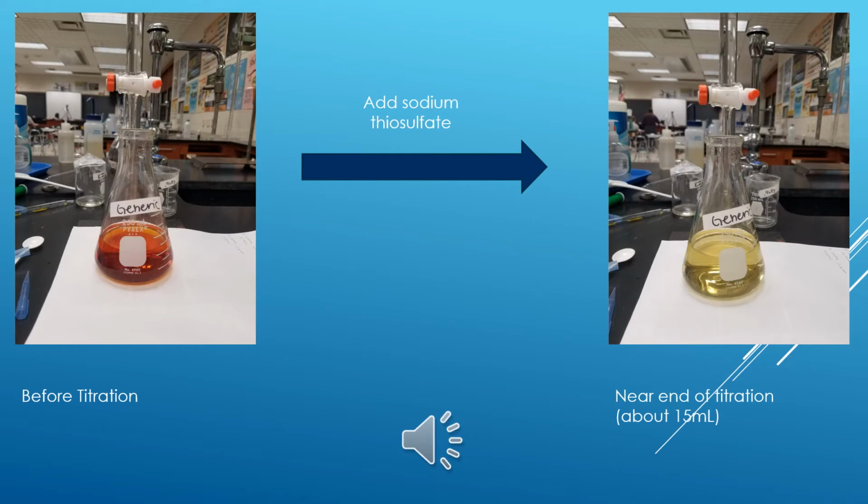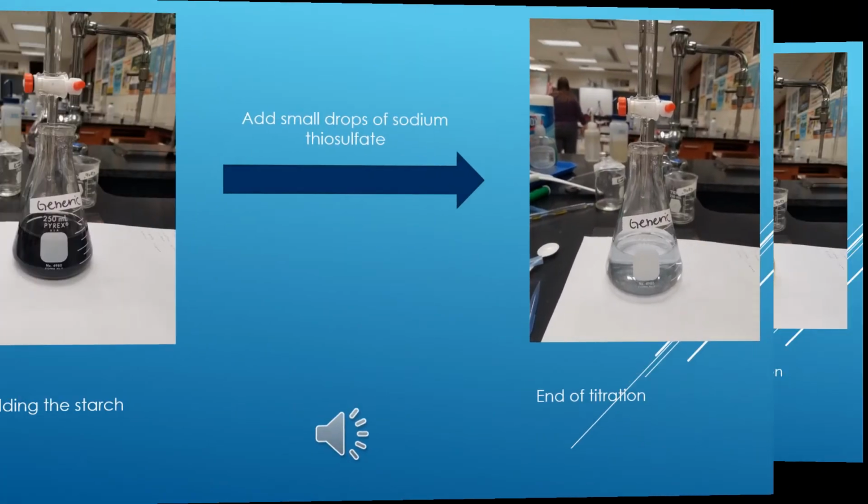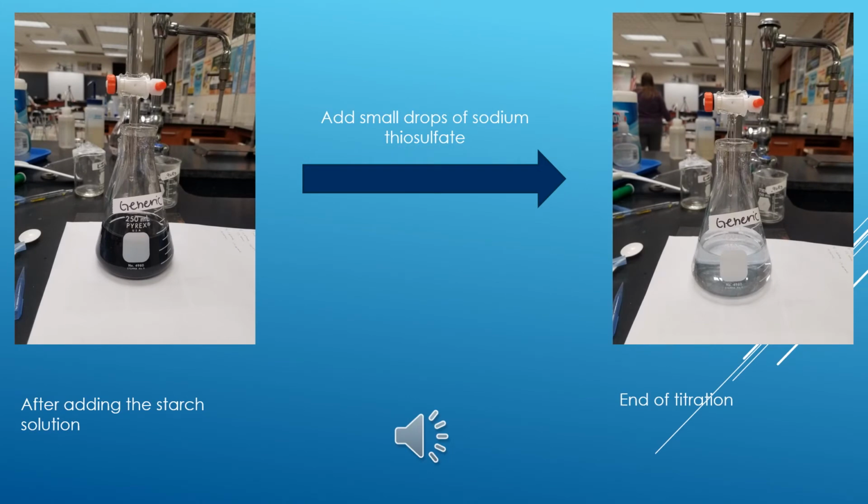I then began my titration by slowly adding sodium thiosulfate until the solution became a pale yellow, which took about 15 milliliters. This is showing that it is becoming more neutralized. To continue the neutralization, I then added 1 milliliter of the starch solution. This would neutralize the unreacted dichromate.